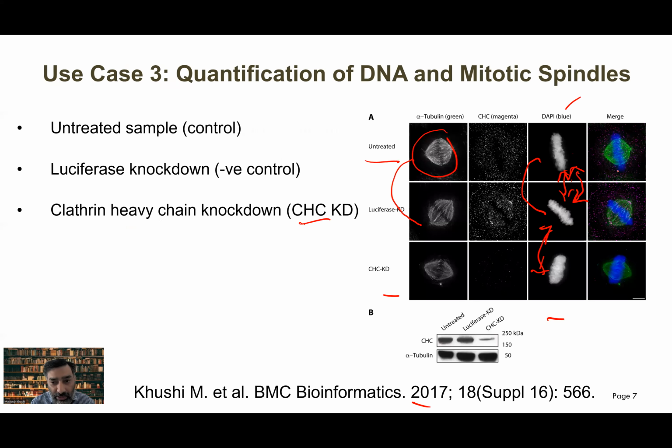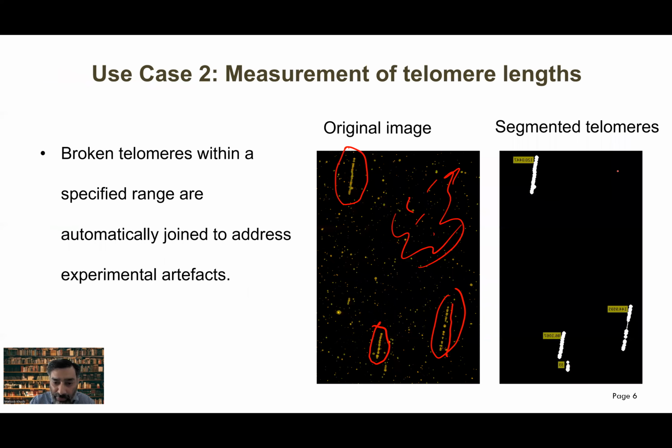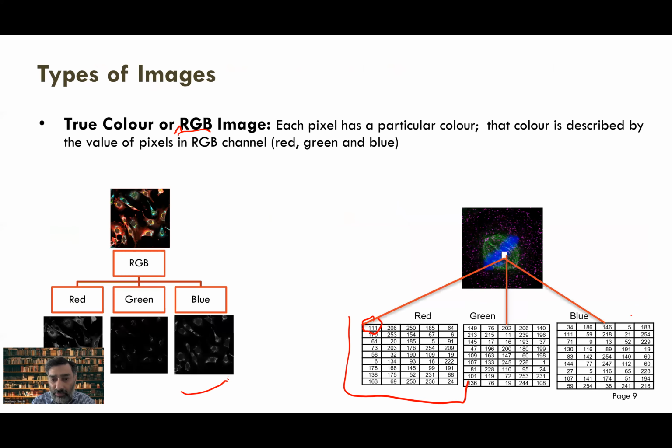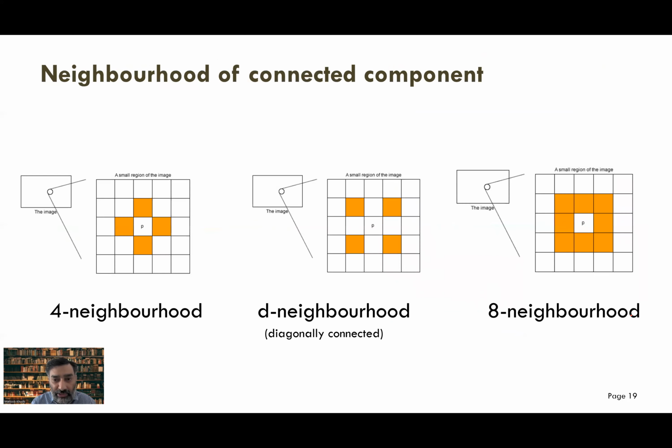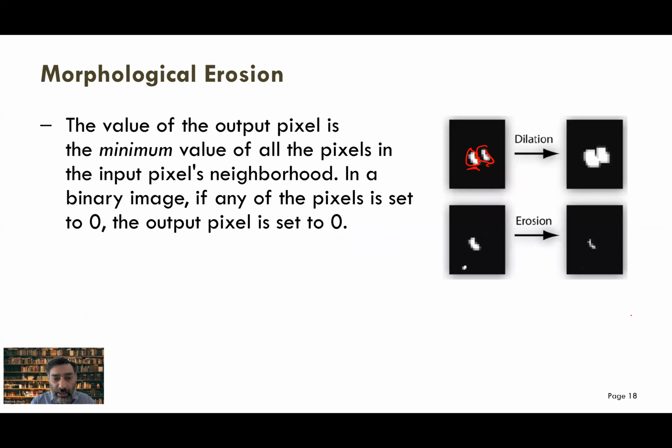And this is what I did. One of the things I did in this work, where we have breaks. Here's a break. So this break was partly being joined together using the dilation process. And I used another method as well, which I won't go into the detail, but one of the things I did is this: dilated the object to join them together, right?